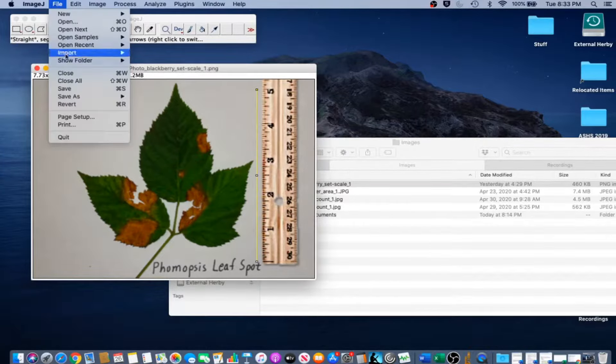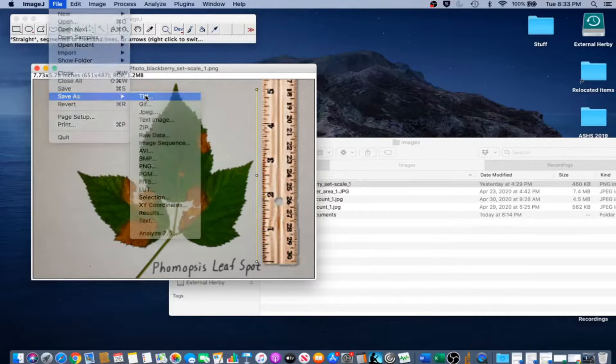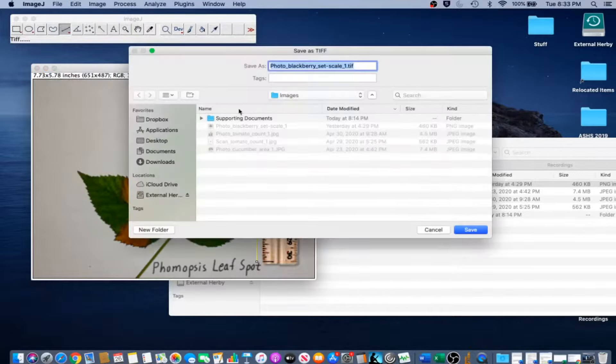We're going to save a copy of this scaled image because we're going to use it later. You can go to File, Save As, TIFF, and go ahead and save.